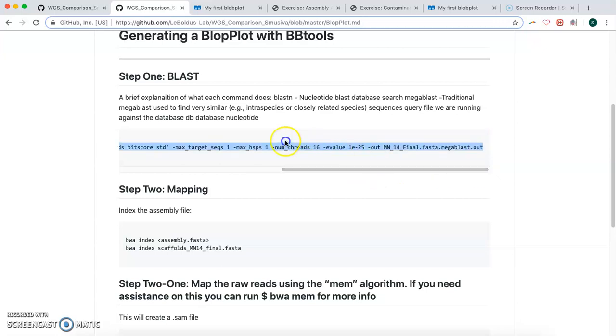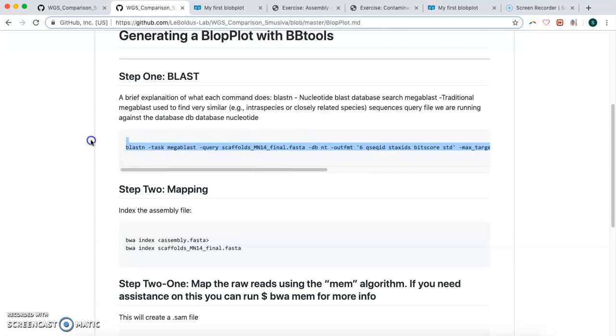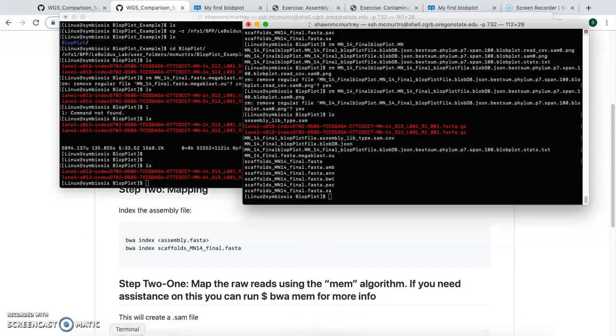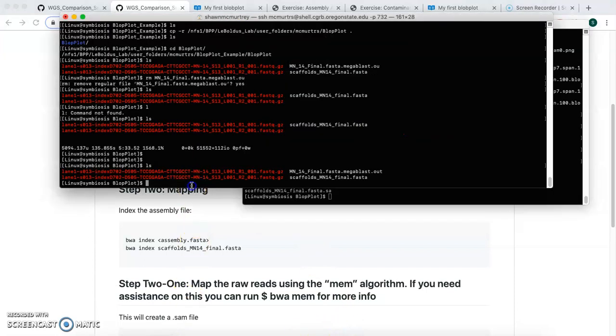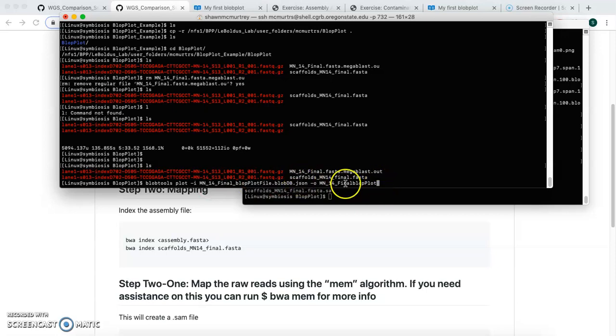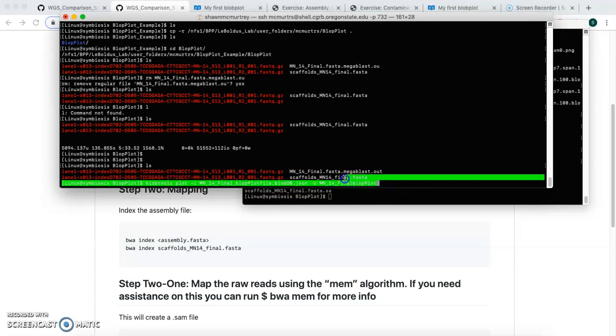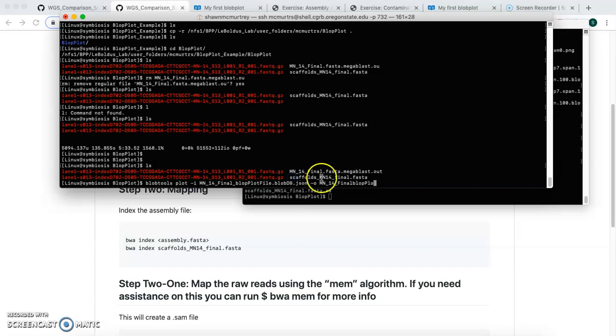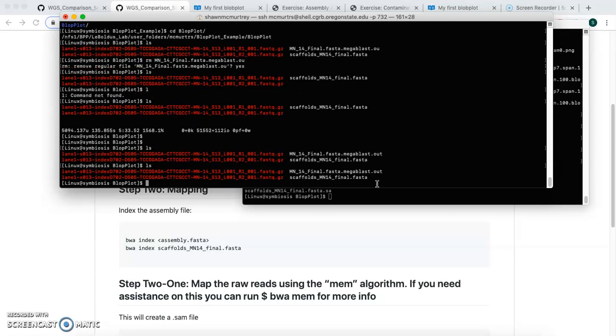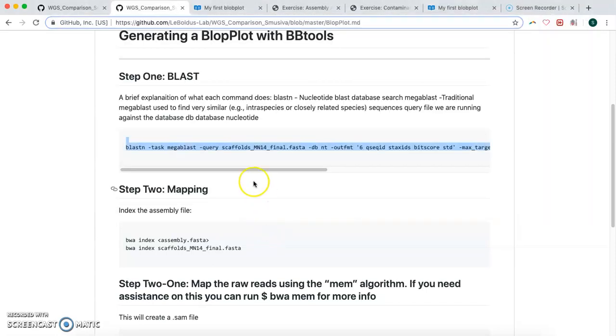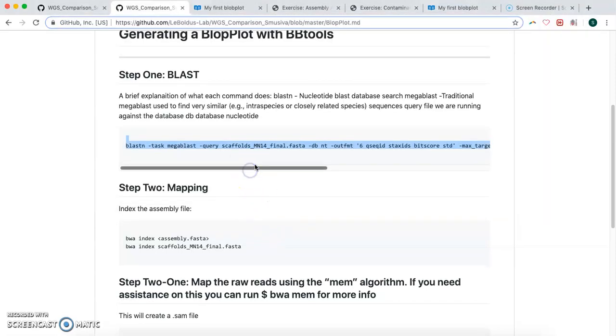But basically from our lab github, we would just paste that and then run that line there, and it would do a BLAST search. We're not going to do it because it would take a while. So that would be the first step.